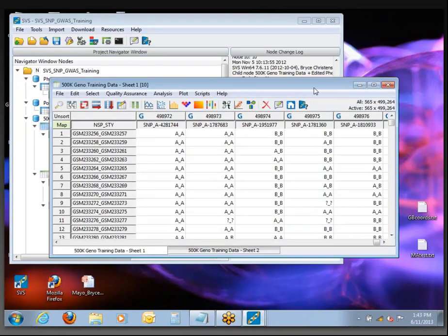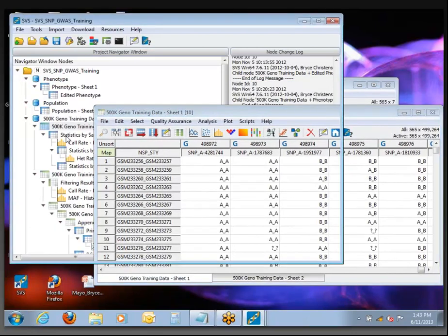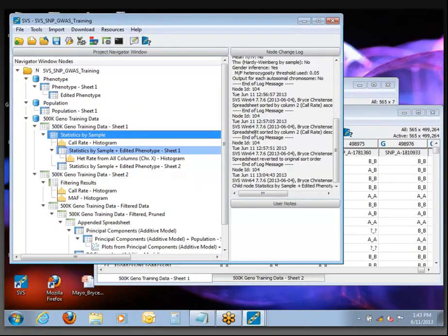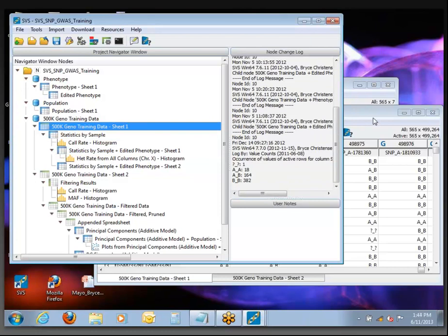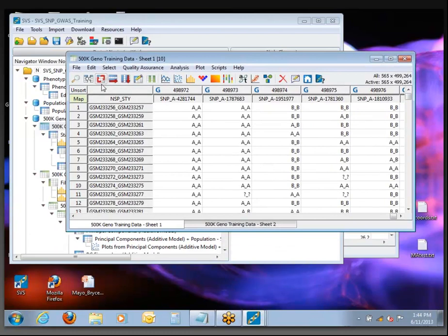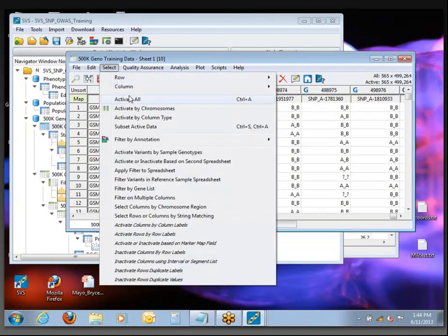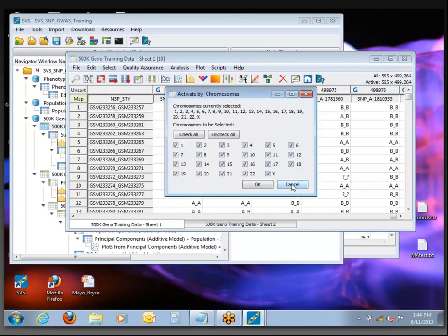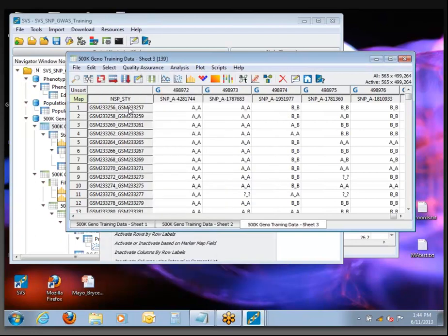That already has everything activated because I ran Statistics by Sample on it. If you don't have this first original spreadsheet with all rows and columns active, the way you can reactivate everything is either to use Ctrl-A keyboard shortcut, or in the Select menu, Activate All — we'll just turn everything on.